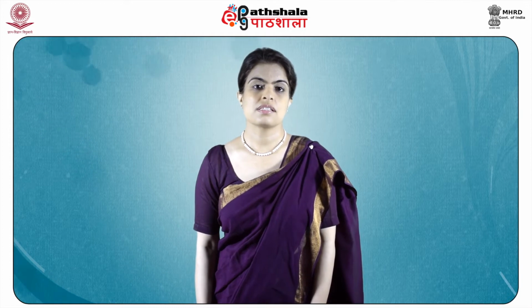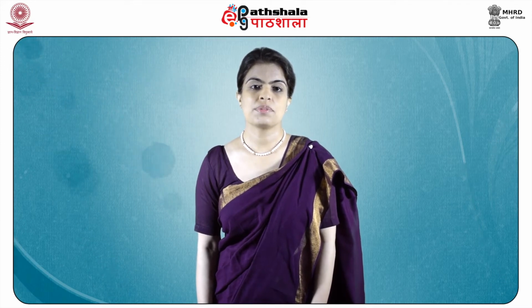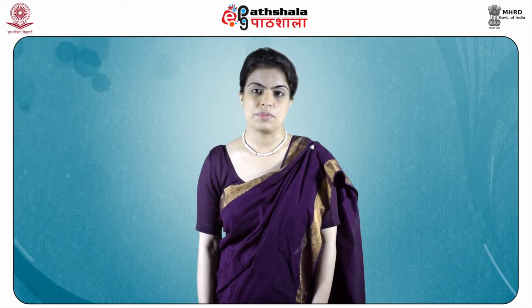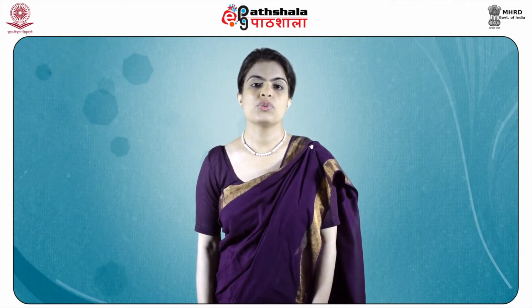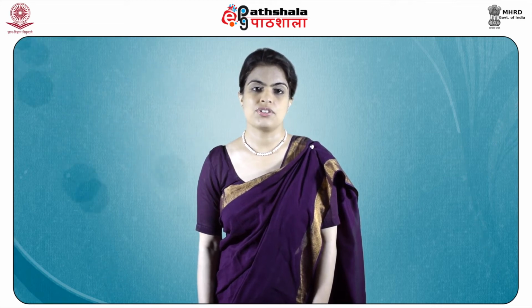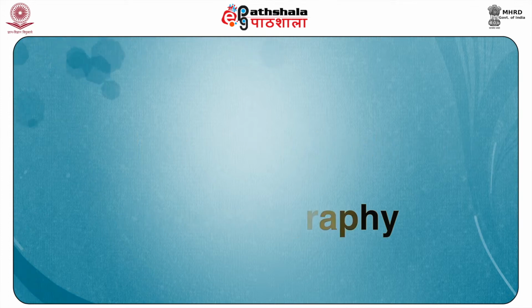Pages discuss the various features that characterize different ion exchangers and the considerations to be kept in mind while selecting an ion exchanger for an experiment. Lastly, it briefly outlines a couple of useful applications of ion exchangers. We'll now be discussing the principle of ion exchange chromatography.